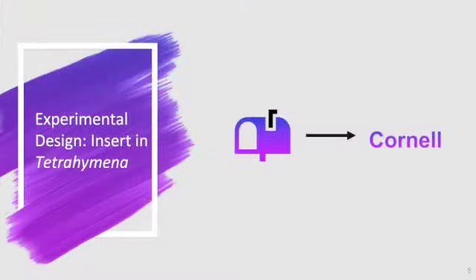The final part of our experiment was inserting the disrupted LC4B gene into Tetrahymena. We were unable to complete this step at Simpson's labs due to lack of technology, so we sent our plasmid containing the disrupted gene to Cornell College's Stock Center to be inserted in Tetrahymena.